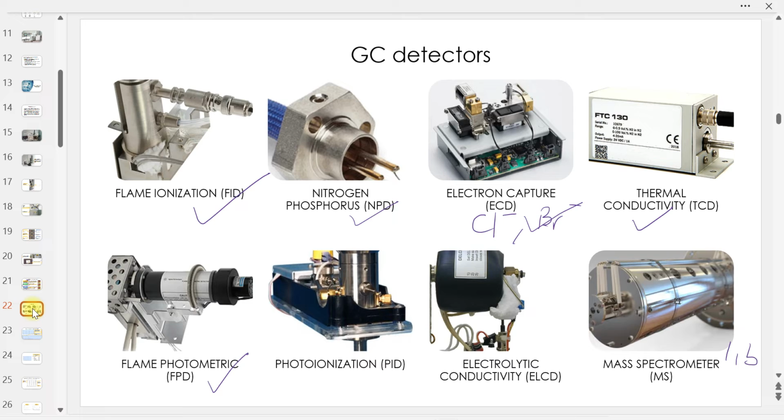So di Jabatan Kimia dulu kita ada FID, kita ada MS. FID ni di Jakin punya laboratory di Bandar Aztec Nilai, they use this flame FID for alcohol detection. Boleh juga. Okay, cuma FID ni lagi murah lah daripada mass spec. Cuma macam kita kalau with advance punya teknologi pergilah ke mass.